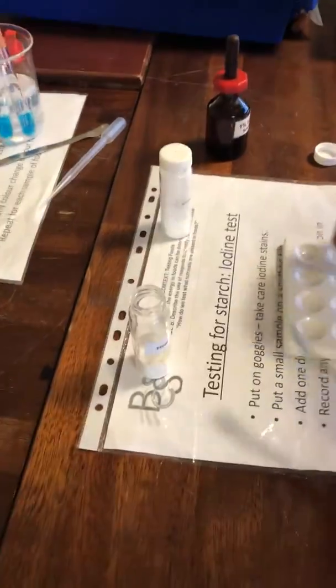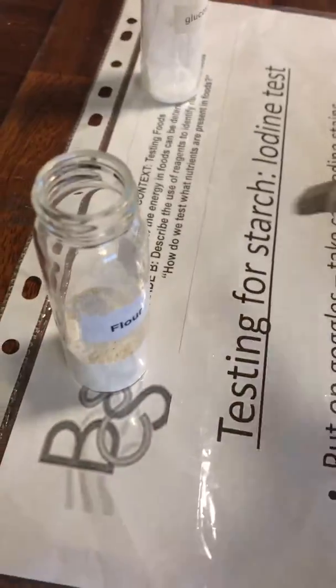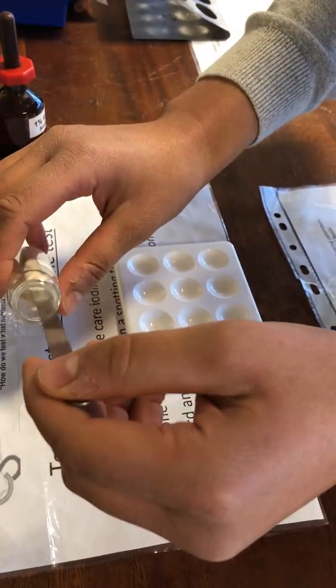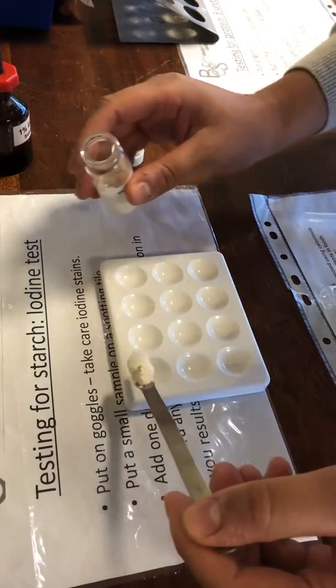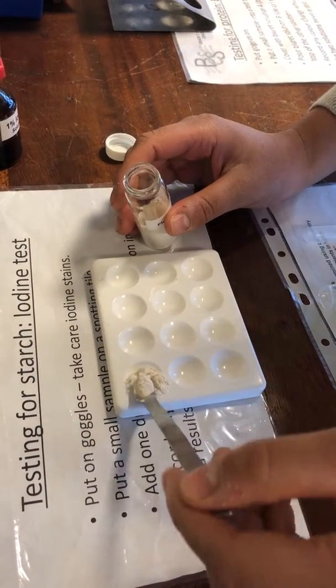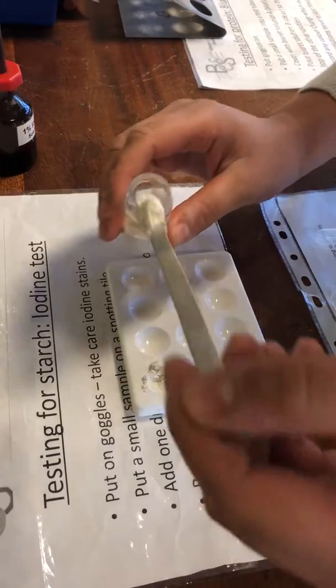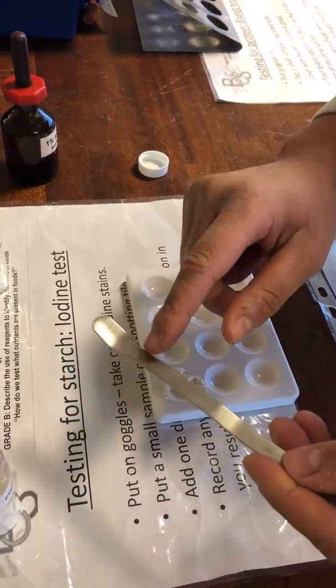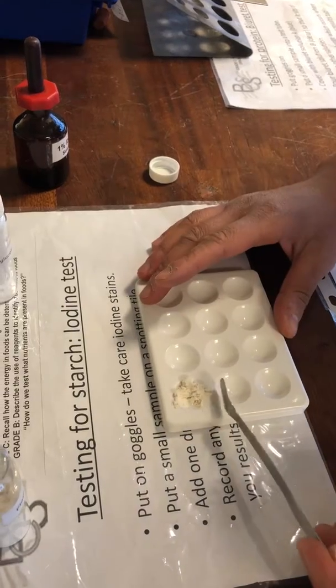We're expecting a positive result for starch from our flour. So this is going to go in first into our spotting tray. We don't need to completely fill it, we just need a small amount. And you've noticed I've completely cleared my spatula because I don't want to cross contaminate.